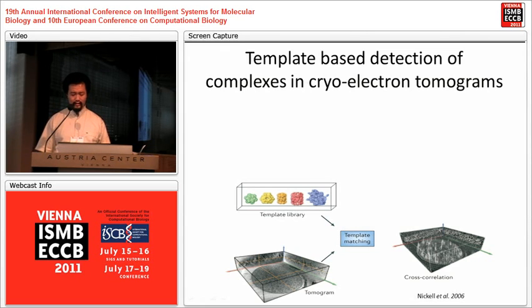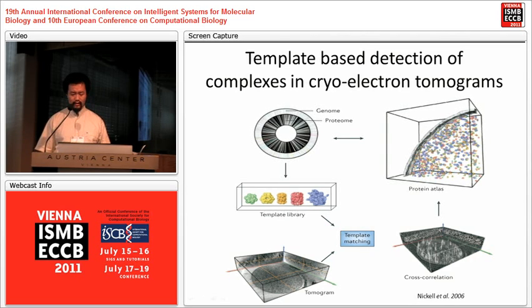This is a very computationally intensive process. By processing all such templates, we can obtain an atlas of the matched protein complexes in the cell that is captured by the tomogram.